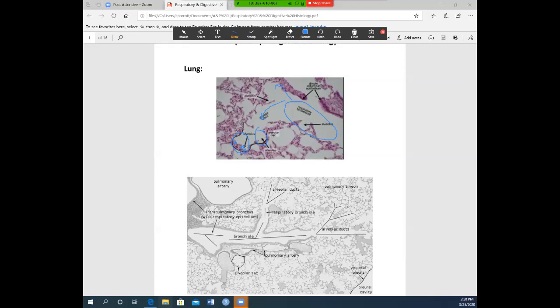In this second slide, you see another picture of the lung. Again, this long tube is your bronchiole leading into the alveolar ducts. You'll see alveolar ducts here as well. The big long one in blue is your bronchiole, leading to the blue areas which are your alveolar ducts. At the end of the alveolar ducts is the alveolar sac, and each little bubble or air pocket is called an alveoli or alveolus — alveolus is singular, alveoli is plural, but on the practical they'll take either one.